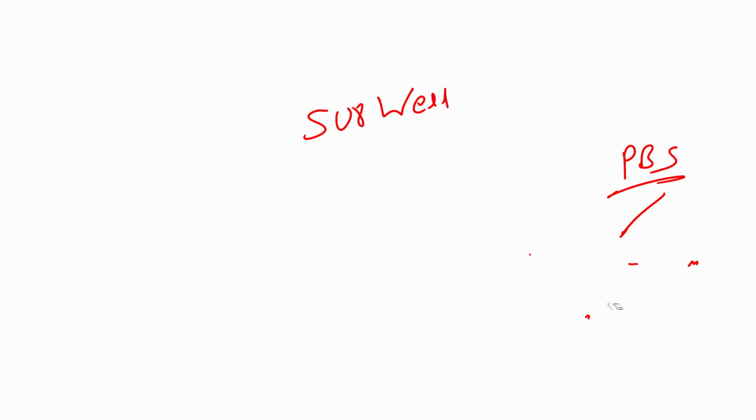So, let us quickly see, it is very easy, just a 2 mask process. Now, you should know, because we are fabricating interdigitated electrodes in SU8 well, inside SU8 well. So, what we will do?